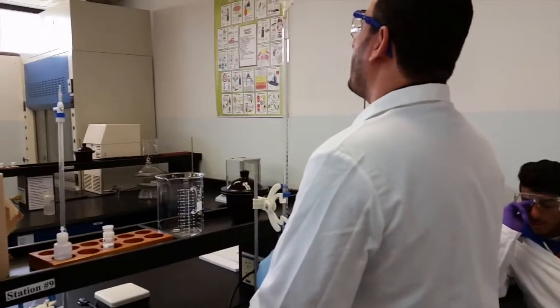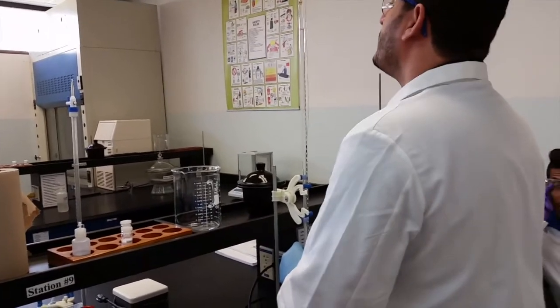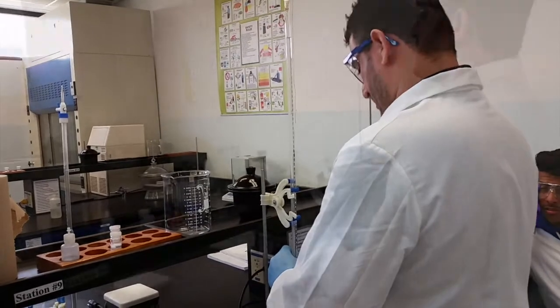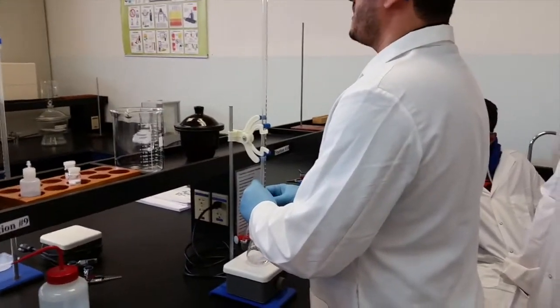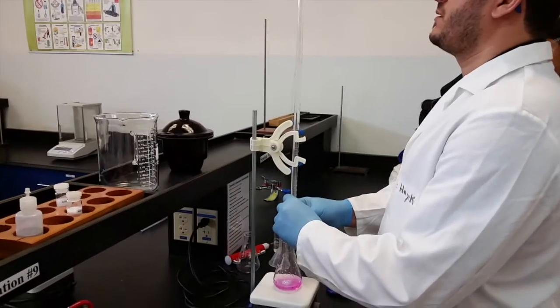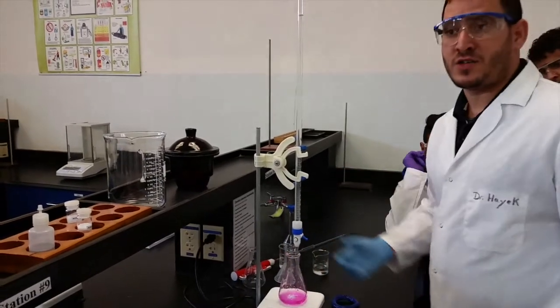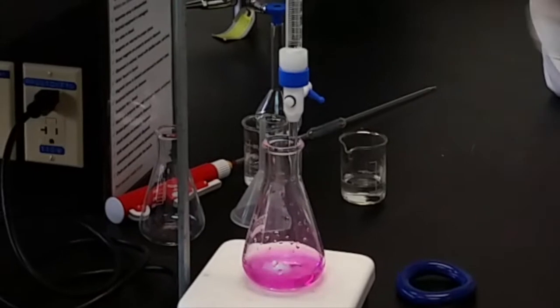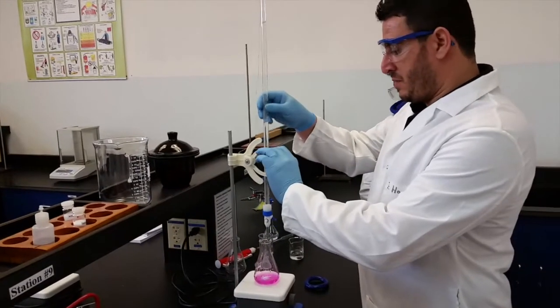I don't need to look down. I'll add 1 and look. Okay? Add 2 and look. So I'm adding 1 milliliter by 1 milliliter. I'm at 9 right now, and the color changed. So I will need a little bit less than 9. So then I take my pipette out.